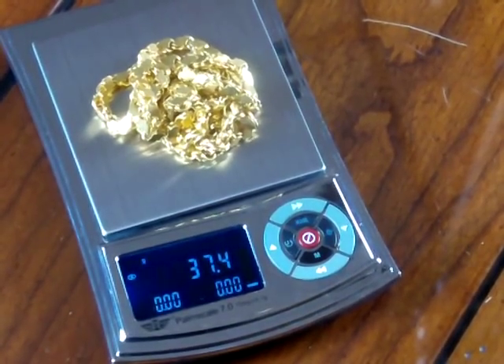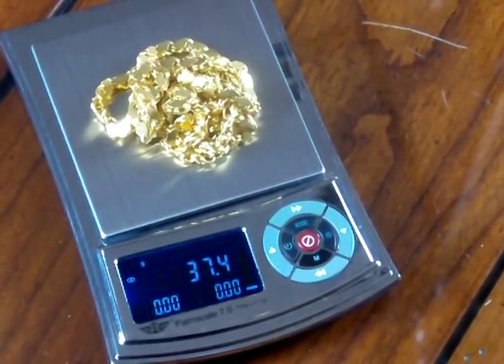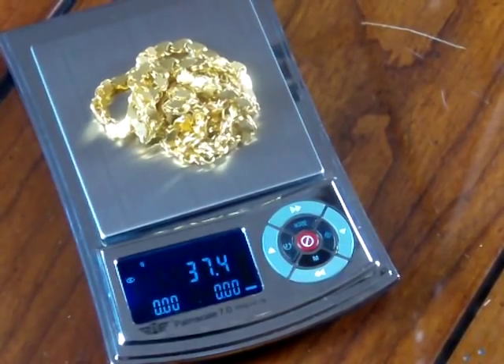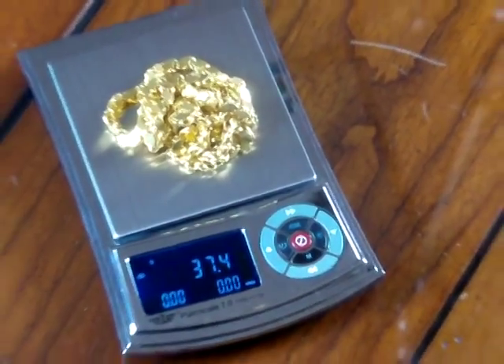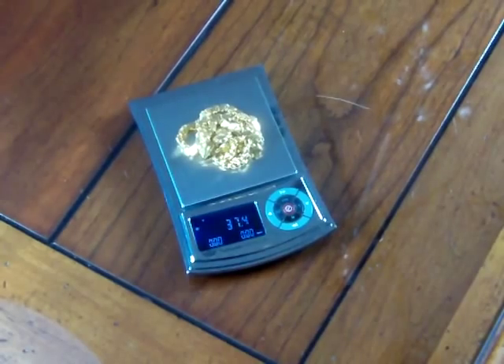Welcome to Precision Weigh and Balances. We're at Balances.com or Scaleman.com. Today we're going to show you the MyWay Palm Scale 7.0. This is the Palm 7, and the scale offers 700 grams by a tenth of a gram readability.